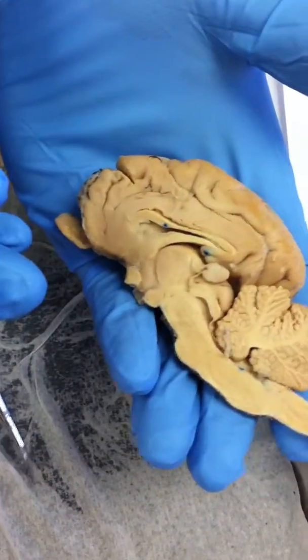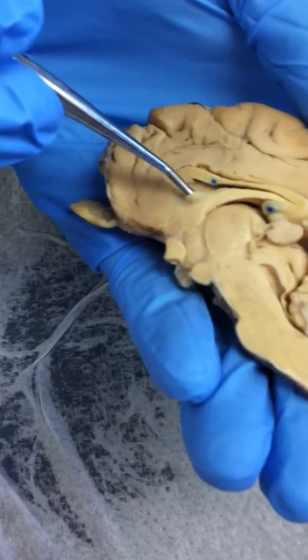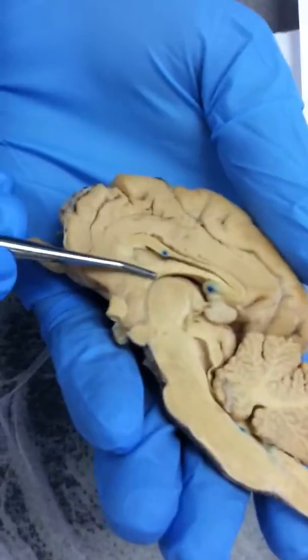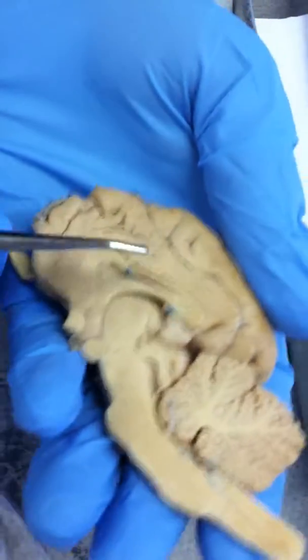So we wouldn't have to identify that because we can't see it? No, you do. It's right here. It's just you're not going to see the whole thing. But you're going to see the skin, like fleshy, on the side. Yeah, it's just like a thin layer of skin that covers. What was that called again? Septum pellucidum.